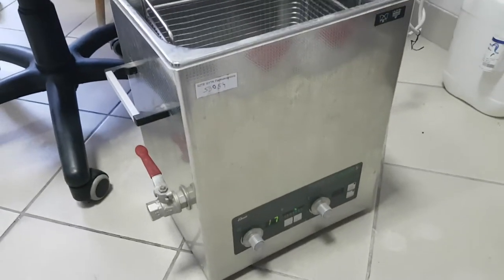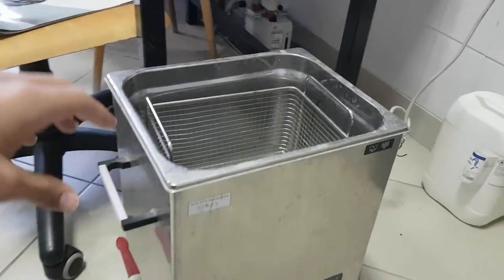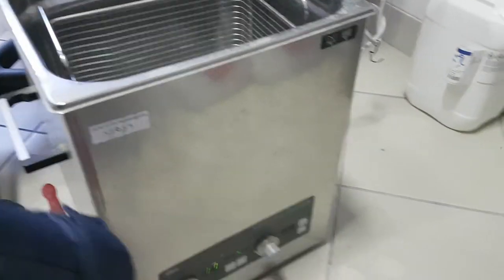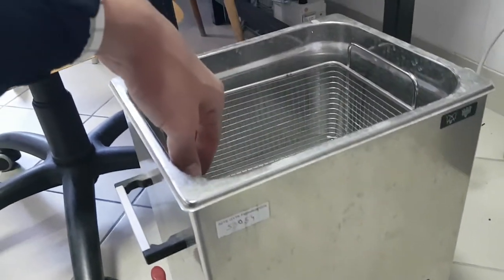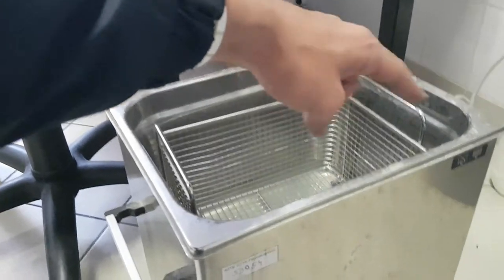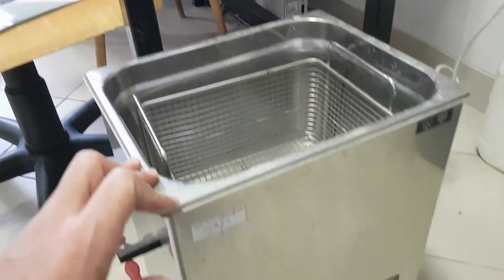For sonification, you need only to put your beaker here inside this bath and you start from here. The wavelength moves from this corner to this corner and we can get a good extraction.